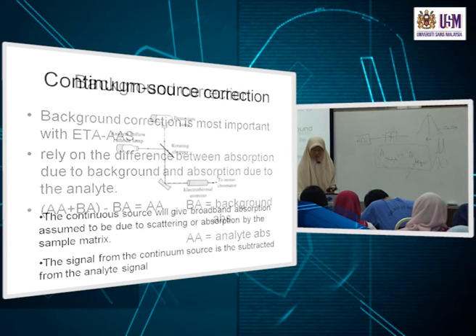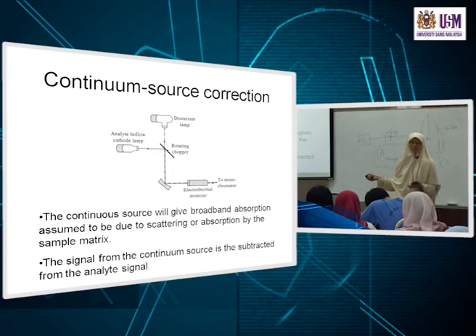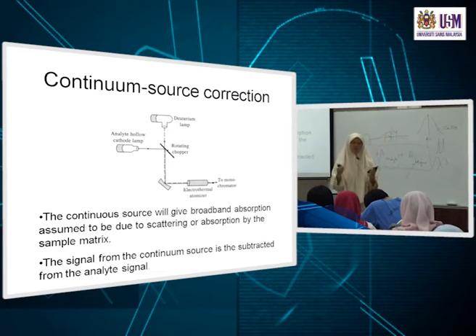And the only catch here is alignment of the two lamps, such that the path is through the same position in the flame or the furnace.